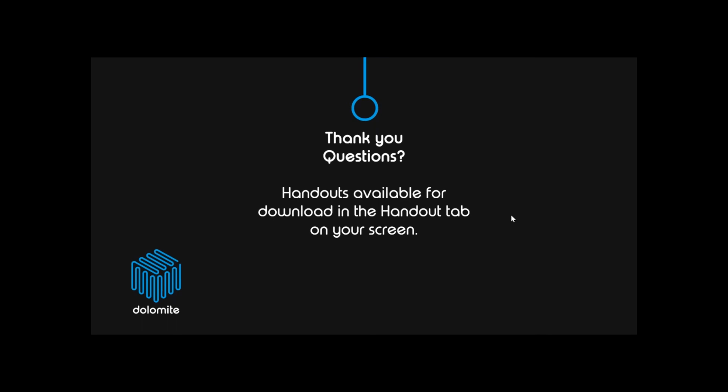Are there any droplets involved in the microfluidic device? So we offer other systems where you can make droplets. With this particular system, our focus is on creating nanoparticles by mixing two fluids. So in this particular system, at the moment, we've designed it to produce nanoparticles, but we envision that future systems can be customized to produce droplets in this way as well. So it can actually potentially be used to produce droplets as well as producing nanoparticles.